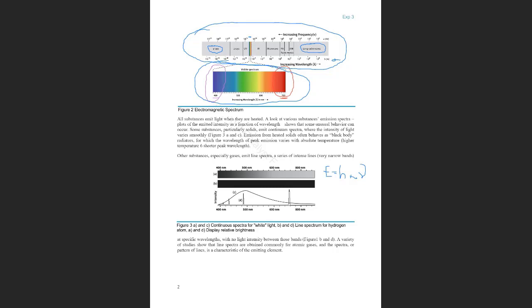We will go over it in the practice test, and you will need this equation in the practice problems to calculate the energy of the peaks at specific wavelengths in the report. And now here they are showing two different spectra, a continuous spectra and a discrete spectra.